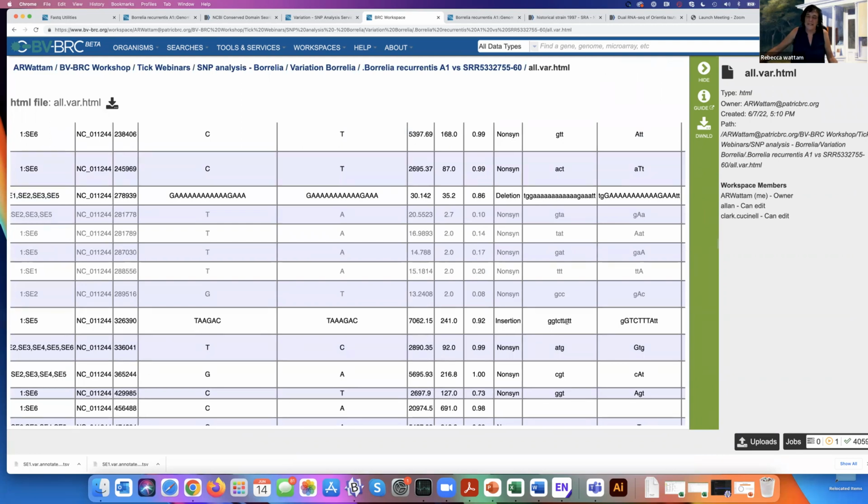Does that get close to what you want? If you wanted an inversion or something, I think you'd need to look at genome alignment, which is our MOV service, which can show you those things at a larger, chromosomal scale. Make sense? Yeah, it makes sense to me.